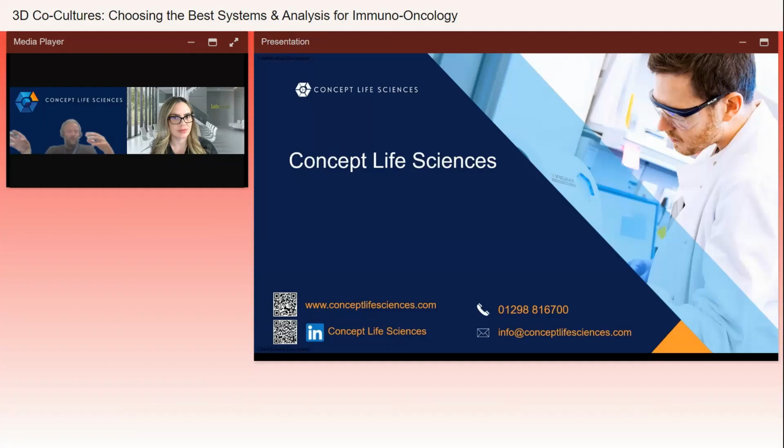I say T cells, when we've done the single spheres, if you add those, they just sit on the outside unless they get direct contact with the sphere, and they might move in. With these hydrogels, if you put them in, they've all got the opportunity to migrate through and migrate to where you want them to. So as I say, it depends on what your question really is.